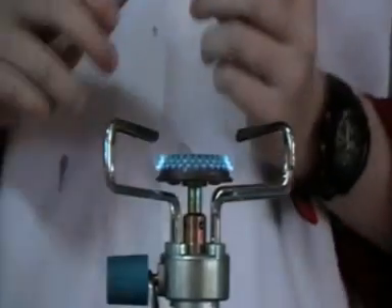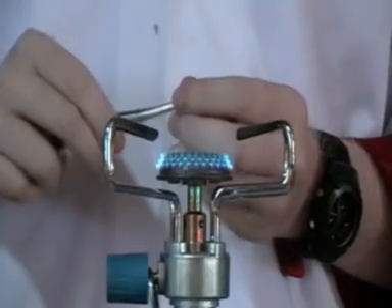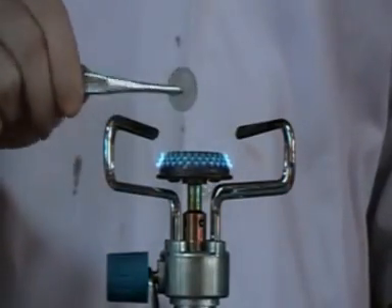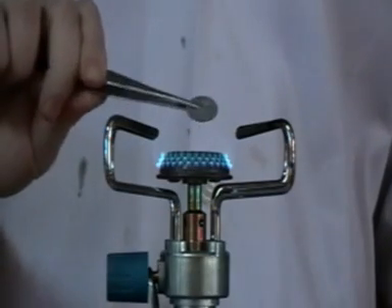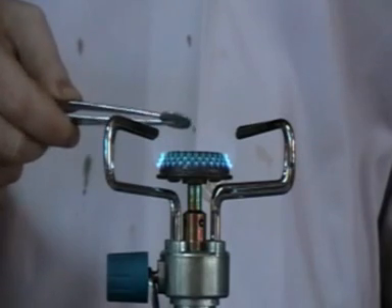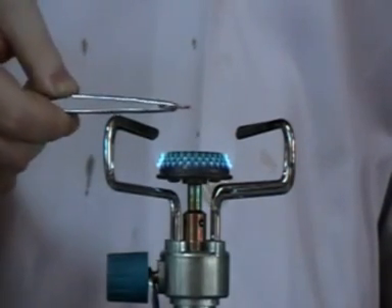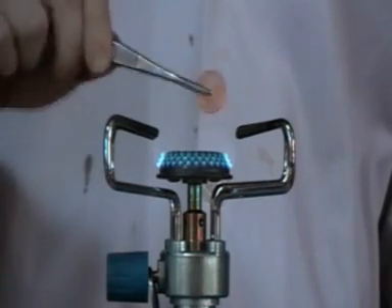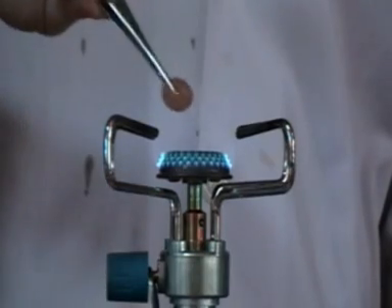We take the silver coin that we just made and put it into the flame. It will change into gold - let it look like gold. It will change from silver into gold. You see that? It's changing right now from silver into gold.